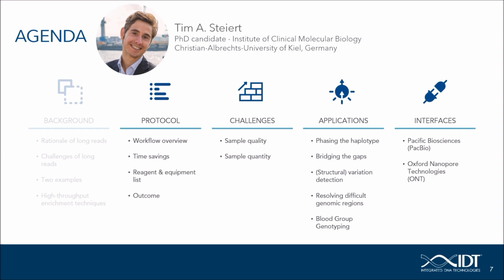After Andre explained the background of everything, I would like to switch gears a bit and give you an overview about the protocol itself, point out the time savings, also state the reagents and equipment required for the preparation, as well as show you some peer-reviewed outcome data of the protocol. Afterwards, I would like to also talk about the challenges, which is mainly sample quality as well as sample quantity, and the applications of the whole protocol.